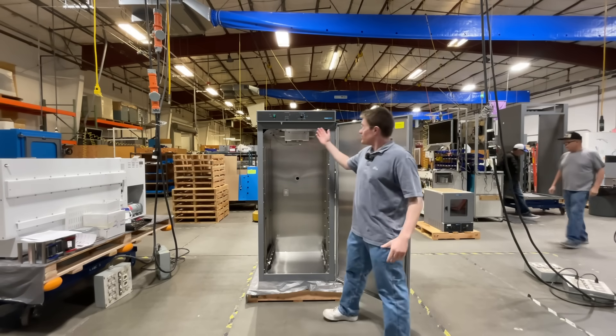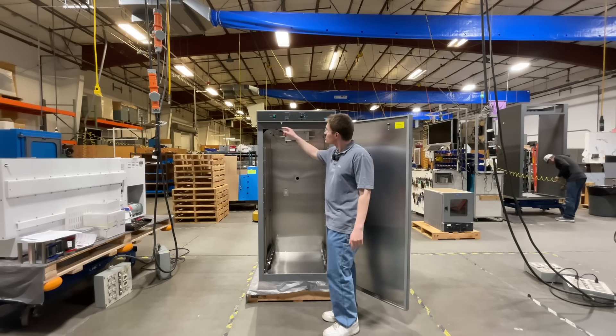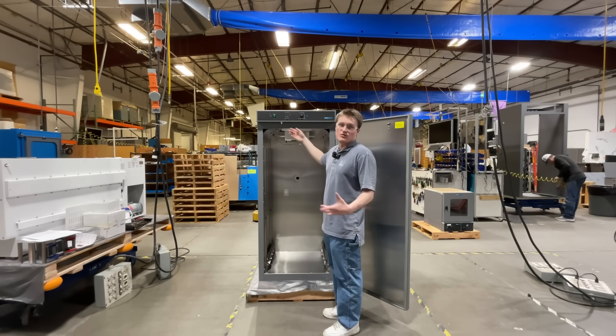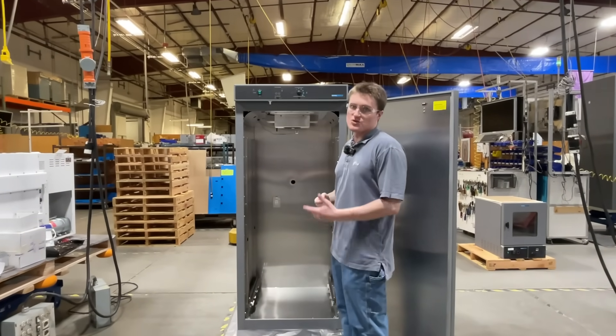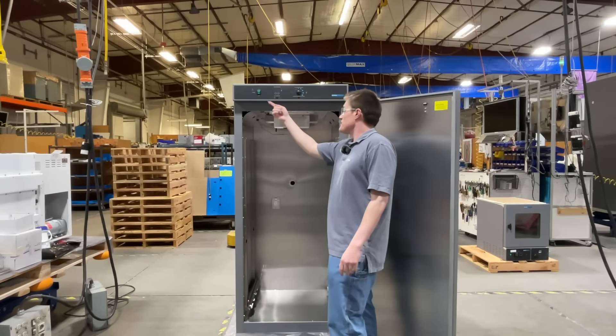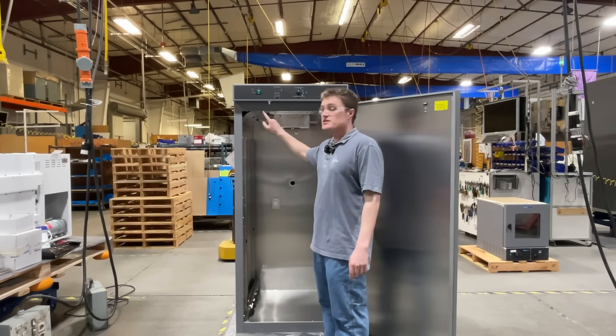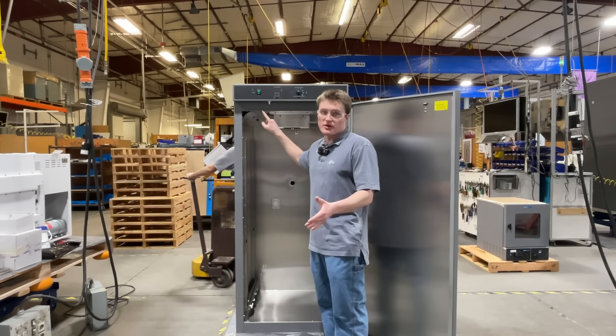Looking inside the unit, you will find two sensors. First, this is the light sensor, similar to one you would find on refrigerators commonly found in your homes or dorm rooms. This operates the light bar, found right here. This sensor prevents operation of the unit while the door is open.